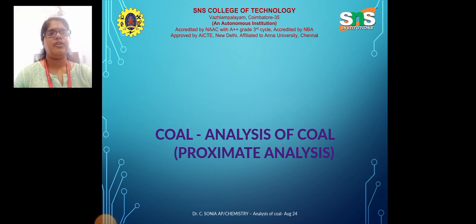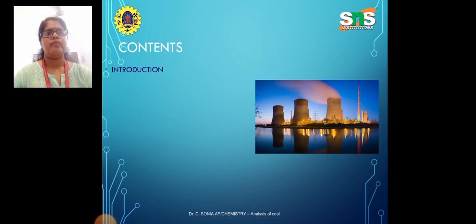In this session, we are going to see about the analysis of coal by proximate method. So there are two different types of analysis. One is the proximate analysis and another is the ultimate analysis. In this video, we are going to see about the proximate analysis.